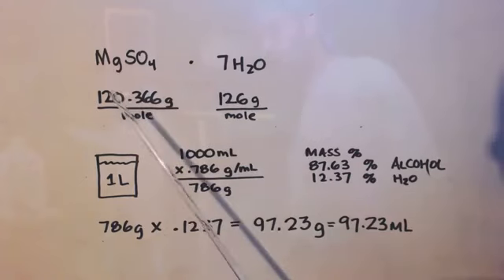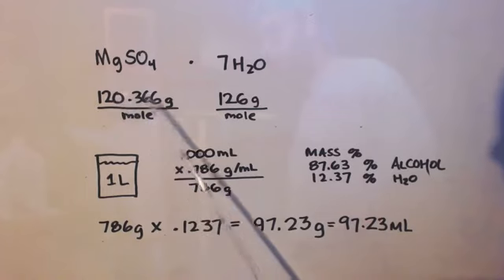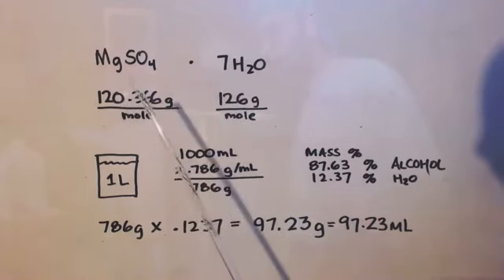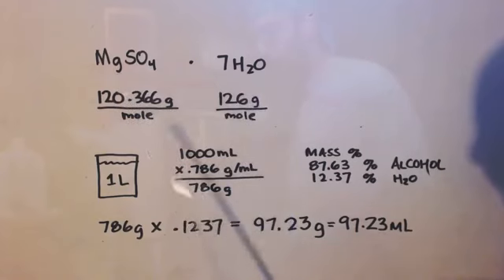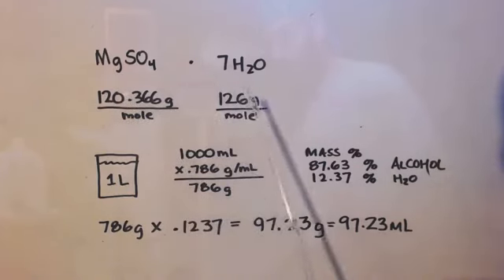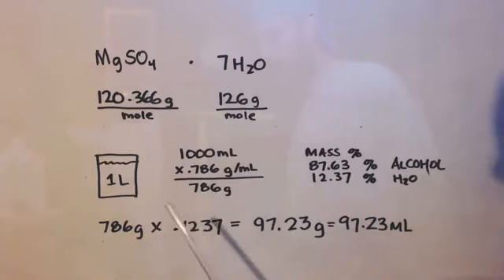So you might as well just say that whatever you use for this is going to soak up the same amount. So if you use 100 grams, you're going to soak up 100 grams. You use 10 grams, you're going to soak up 10 grams. You know what I mean? And you just throw a little bit of excess in. You can think of it that way if you want, because it is close.